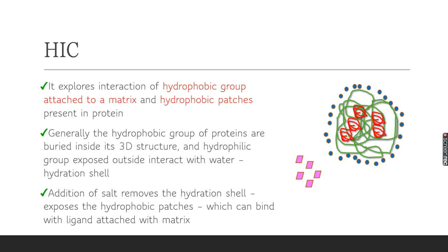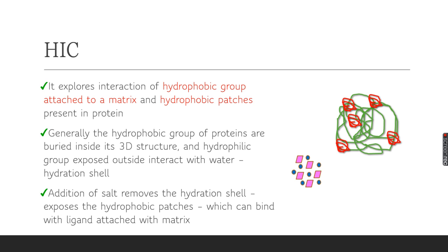then the salt is likely to interact with the bound water molecules. So water will be removed, or the water shell from the protein will be removed. Essentially, if water is removed, the hydrophobic patches will finally be exposed. You can see the hydrophobic patches have come outside, and they can bind with the ligand in a very effective way, or we can say the interaction can be positively channelized.